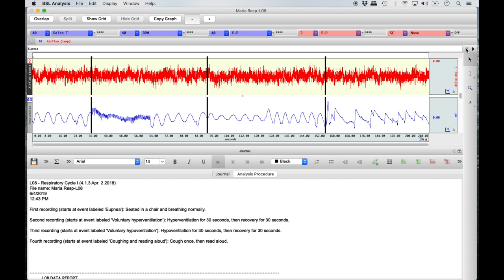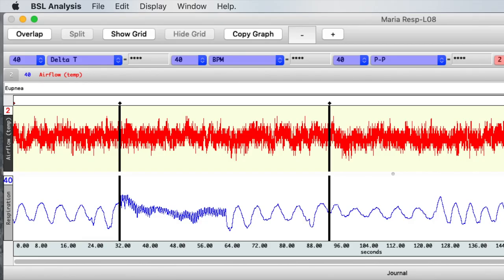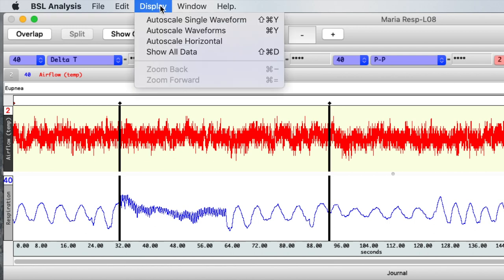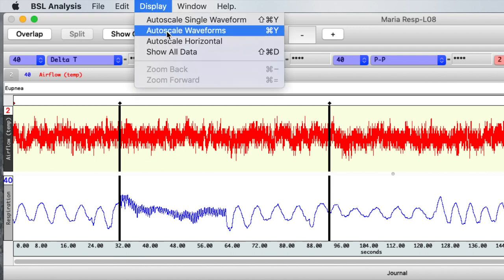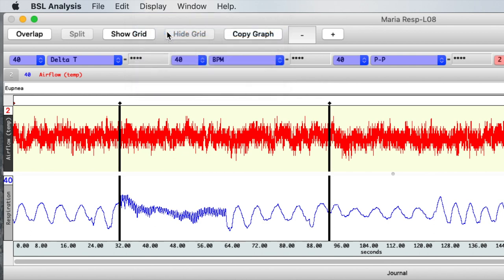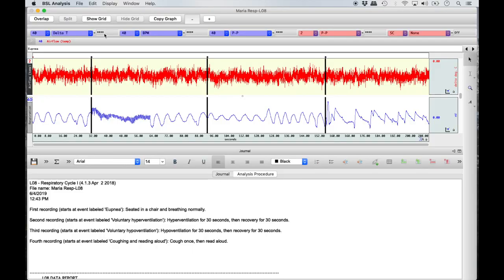Now that you know how to identify each recording condition, select Display in the top menu bar and then Auto Scale Waveforms from the menu list. This will ensure the entire respiration recording strip is in clear view with none of the cycles cut off. Ignore the airflow temperature recording strip in red, as airflow temperature was never recorded.